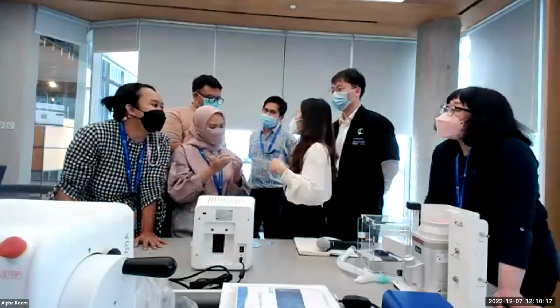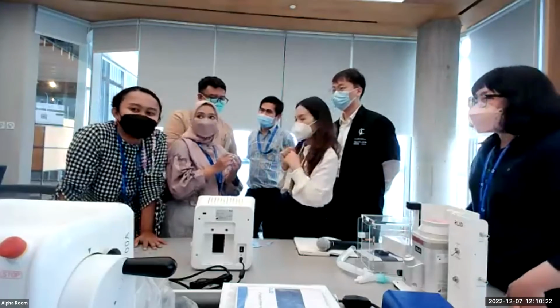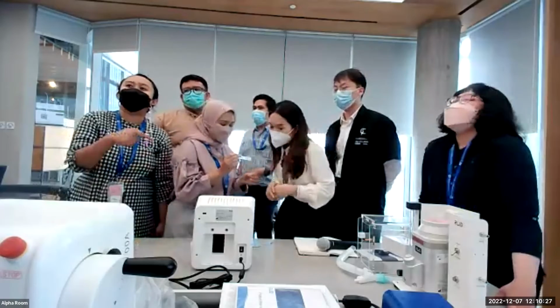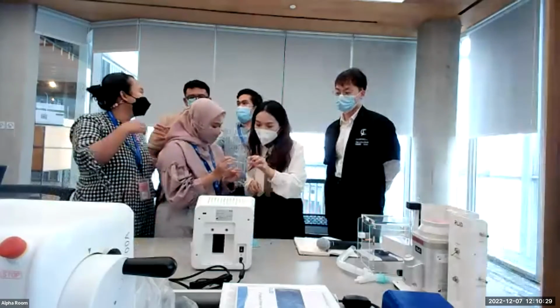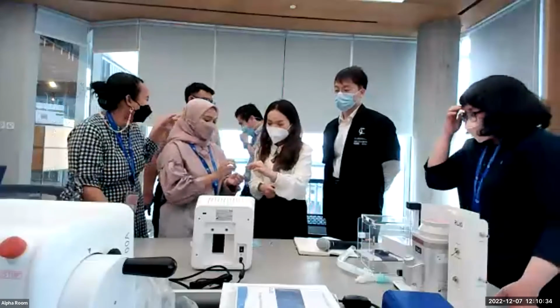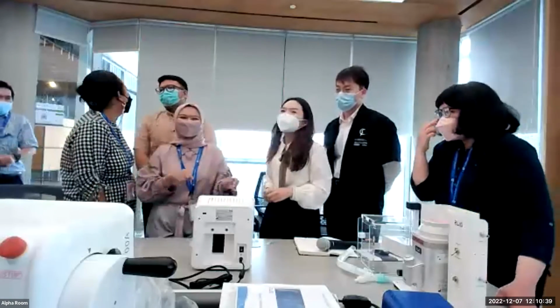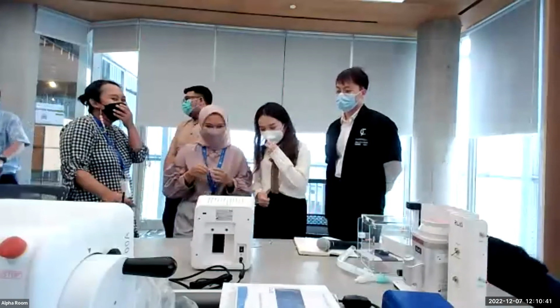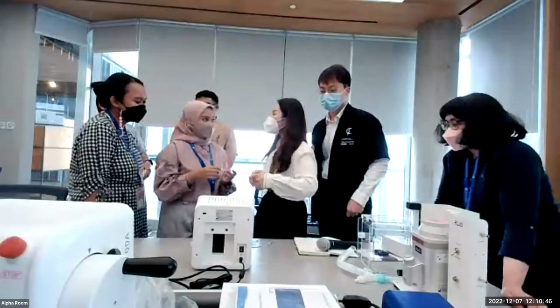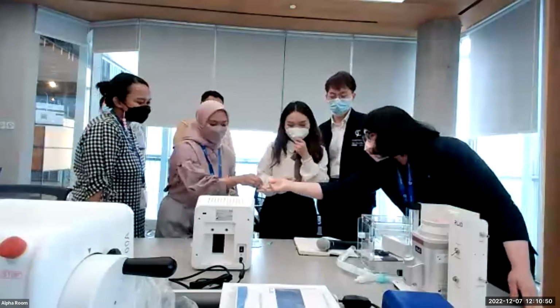But on plastic, I identify the plastic. When loading, make sure there are no bubbles, in case the user is F1. How to remove the bubble? Maybe you can just shake. Yes, just shake, and the device can still identify that. So don't worry too much about that.